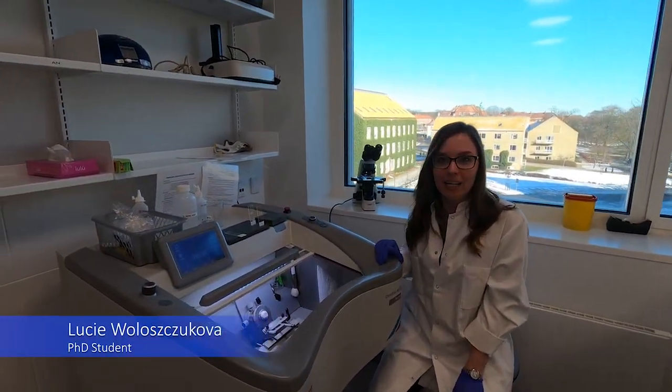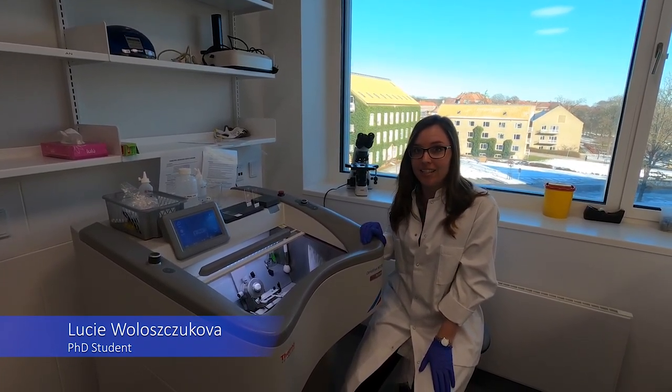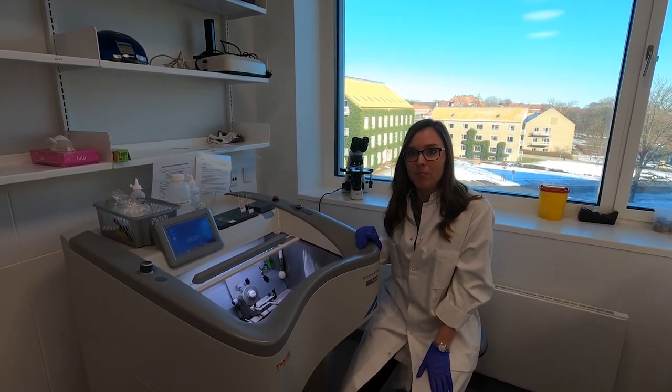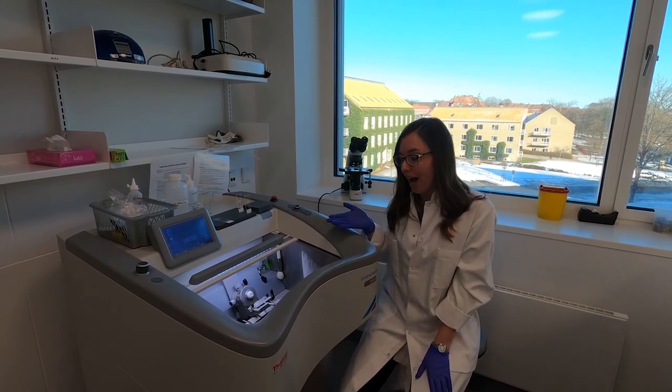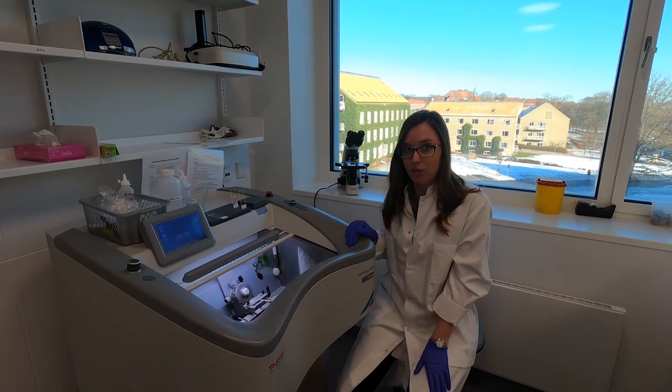Hello everyone, my name is Lucka and I'm from Czech Republic and I'm a PhD student in Anders' lab. I heard that you need some help with cutting brain tissue. I'm currently processing my embryonic brains of 14 days of age.